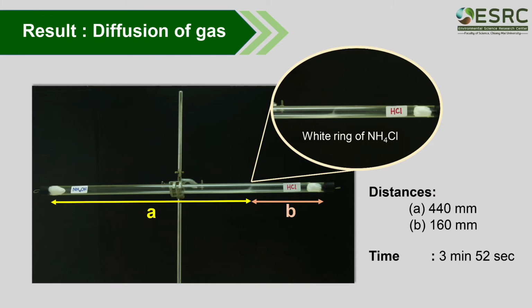Notice the white ring in the tube as shown in this picture.